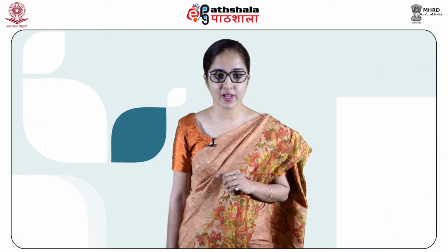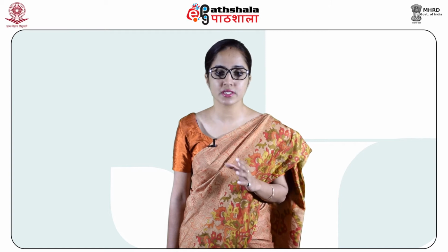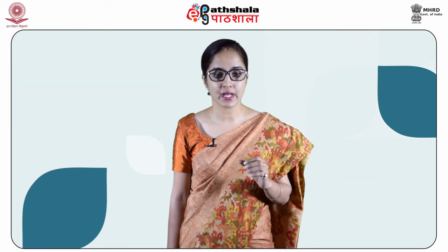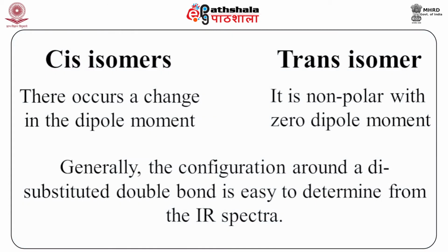By using this fact, students, we can distinguish between cis and trans isomers using IR spectroscopy. In cis isomers there occurs a change in the dipole moment, whereas the trans isomers are nonpolar with zero dipole moment. Generally, the configuration around a disubstituted double bond is easy to determine from the IR spectra.